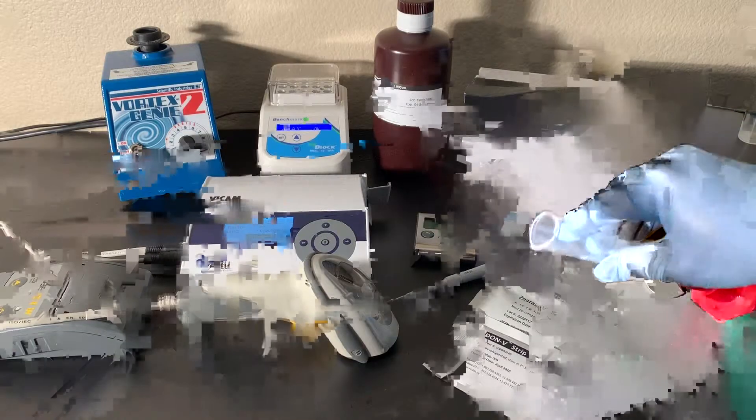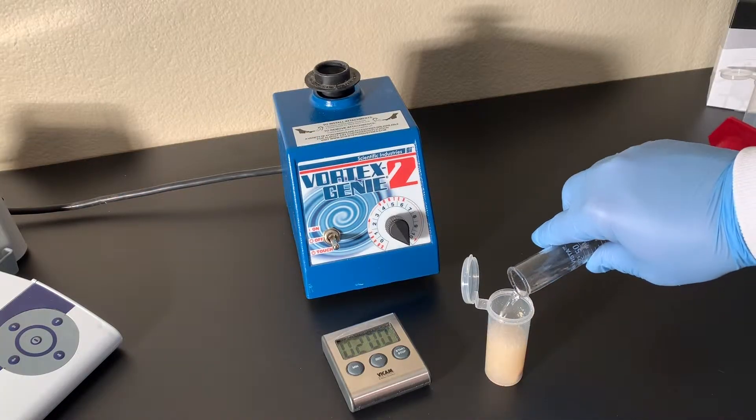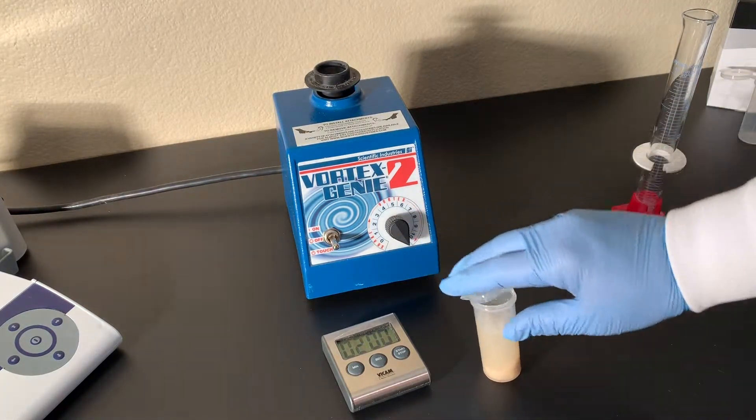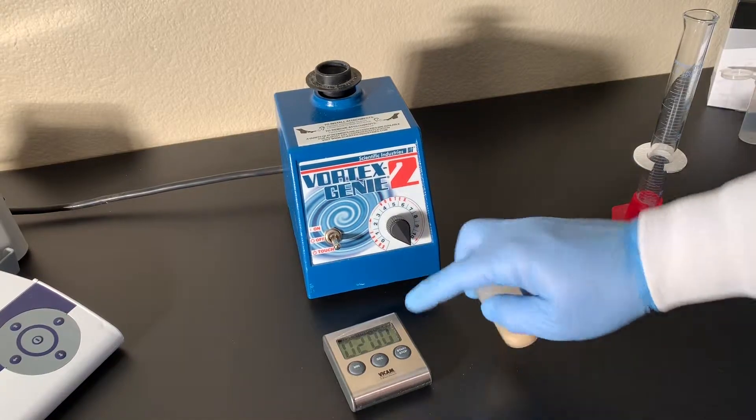Weigh 5 grams of finely ground sample into an extraction tube, then add 25 milliliters of aqua premix. Extract the sample by vortexing at high speed for 2 minutes.